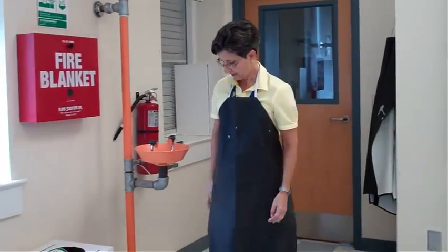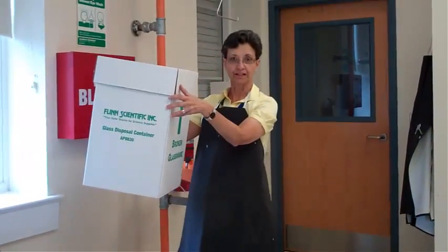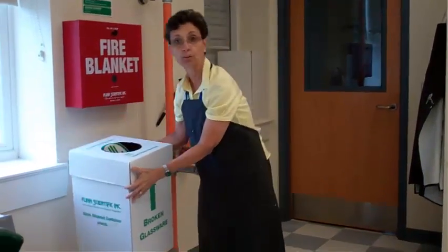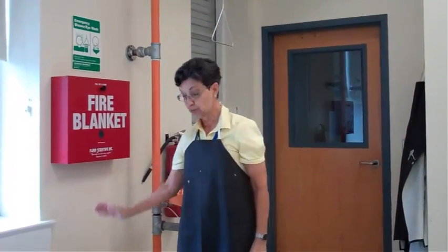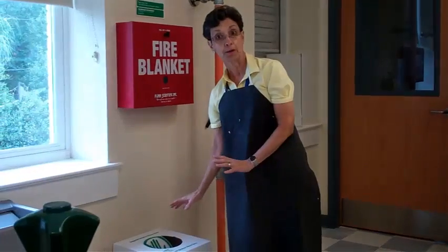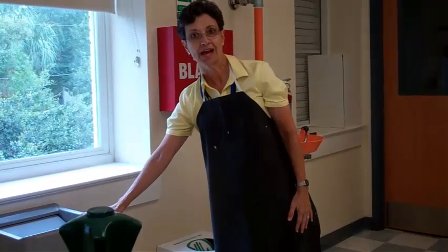Over here we have the broken glassware box — it's this box right here. Whenever you have any broken glass, you are going to let me know and I will place it in here. It will be disposed of properly so that nobody cuts themselves. We do not want it in the trash.